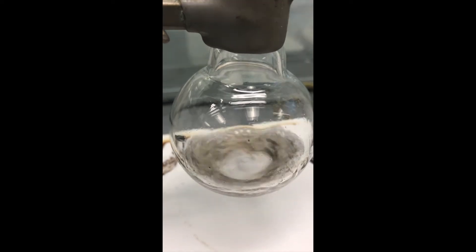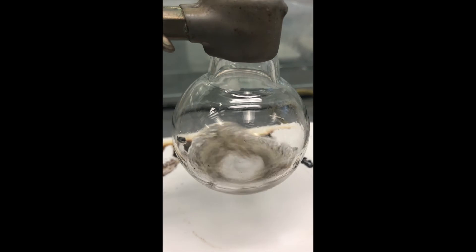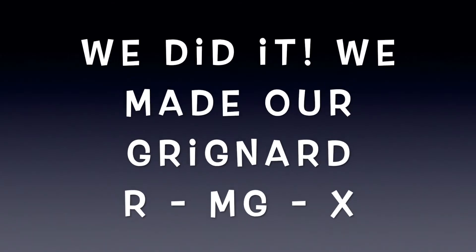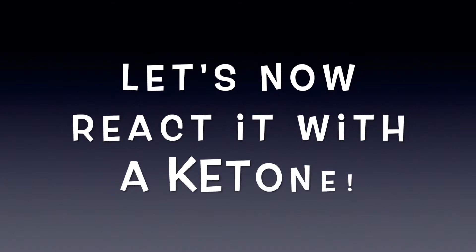At the 30-minute mark, I turned the hot plate off, allowing the reaction to come back to room temperature. We made a Grignard reagent. Yay! Congratulations! Now let's go ahead and react that with a ketone and make our final product.